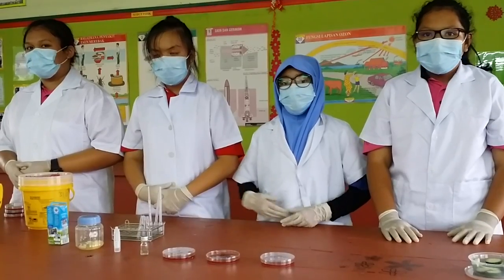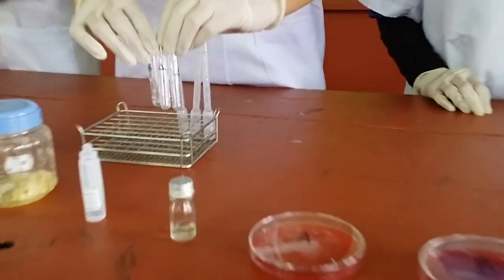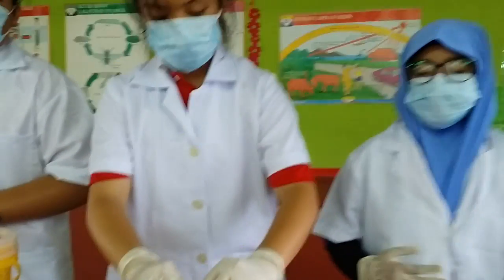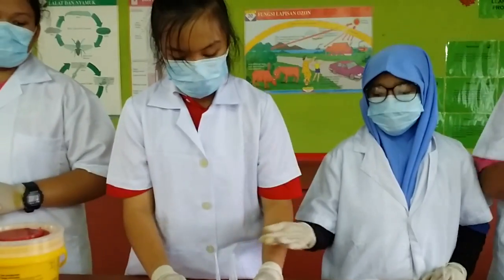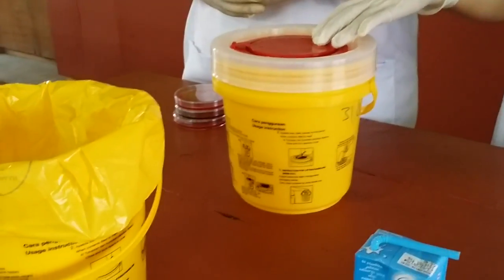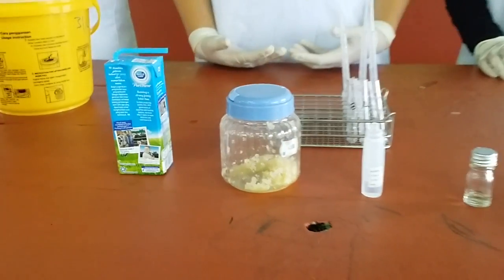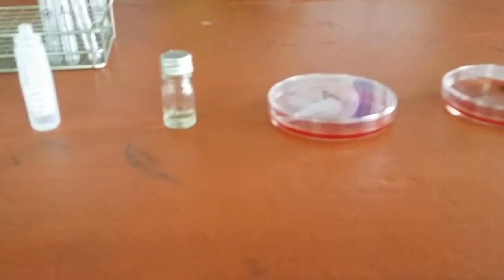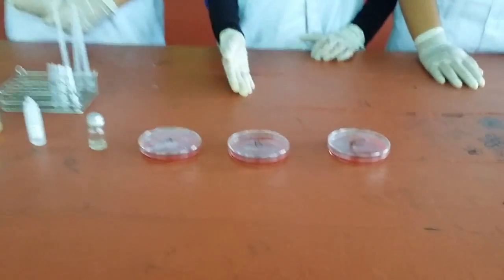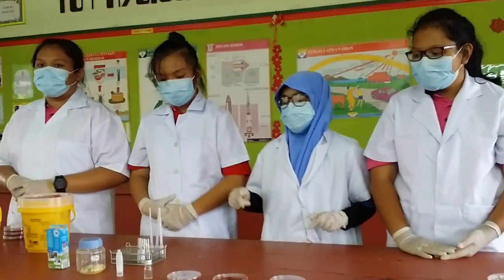Now I'm going to tell you about the materials needed in this experiment. First we need three test tubes, a test tube rack, pipettes, sharp bin, clinical waste bin, milk, five pieces of blended garlic, sterile water, transport medium, three agar petri dishes that have been labeled A, B and C. And the most important thing in this experiment is the E. coli bacteria.